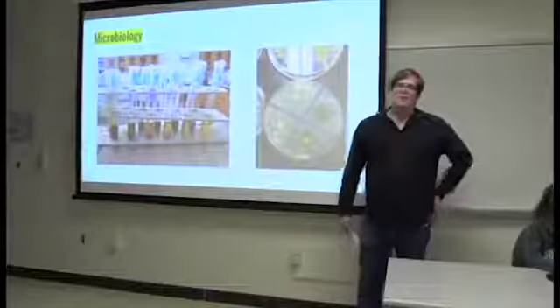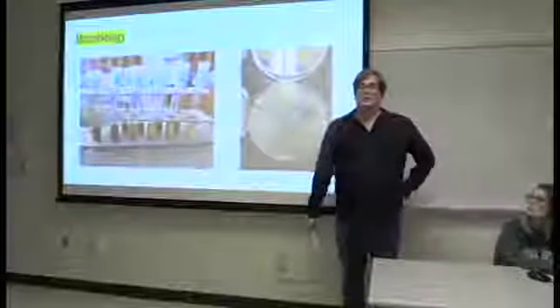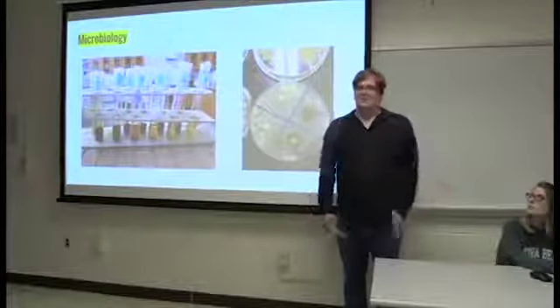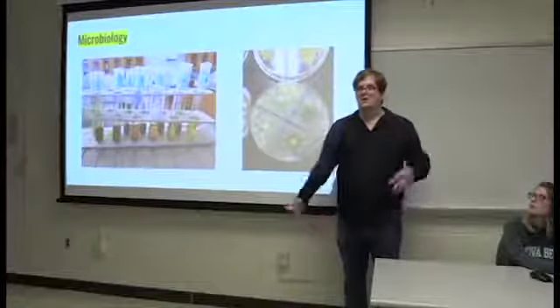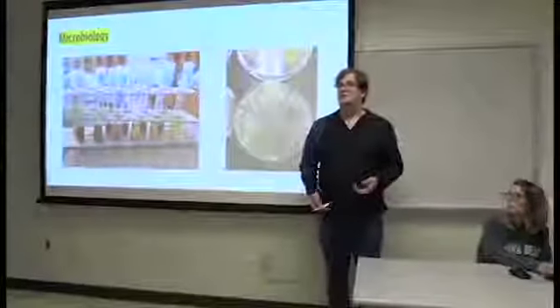Also, we had a microbiological contingent of this project, and we inoculated plates with 6 different types of bacteria, gram-positives and negatives, etc. We controlled for things like concentration, pH, the presence of ion, and the identity of the ion, to try to see if different complexes would work.